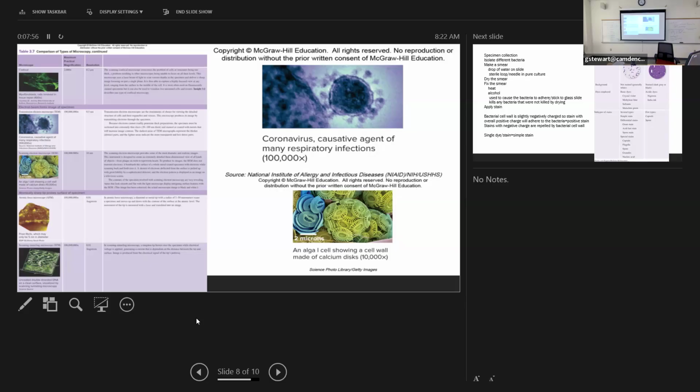The other thing I will say about a transmission electron microscope is the maximum magnification, the total magnification, is 1,000,000 times the size of light. That's a lot more than 2,000 times the size of light, right? So I'll just write it over here. Maximum magnification is 1,000,000, 1 times 10 to the 6th x.